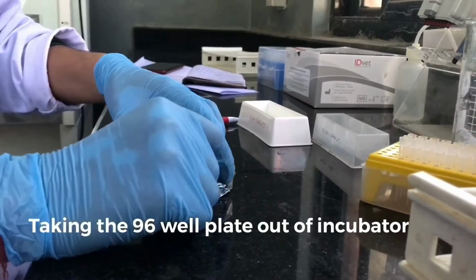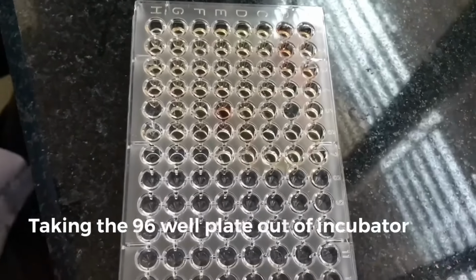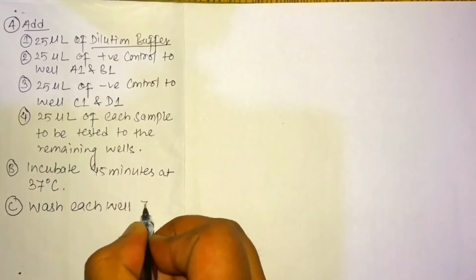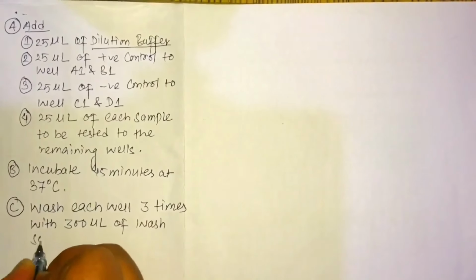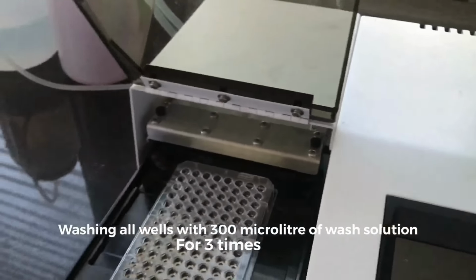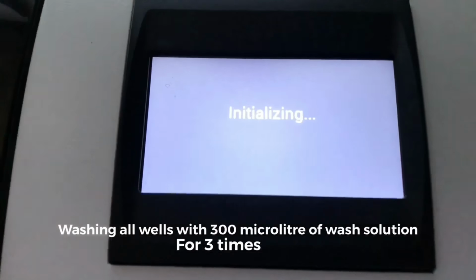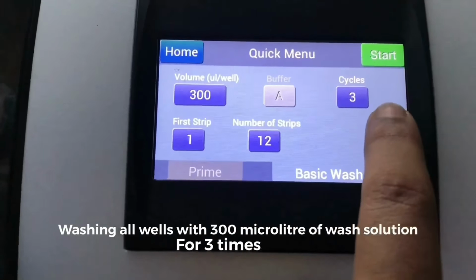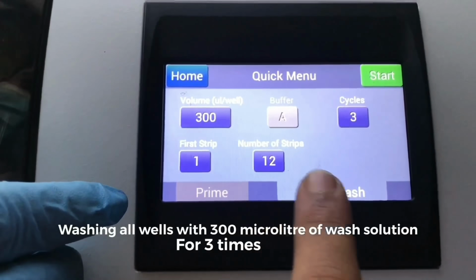Out of the incubator, we will wash each well 3 times with 300 microliter of wash solution. The wash solution is also provided with the ELISA kit, but this time we will be using the automated washing machine or washer that already has the same wash solution as provided in the kit. So we will be keeping it on 300 microliter and the cycle will be for 3 times. So we'll be starting this.